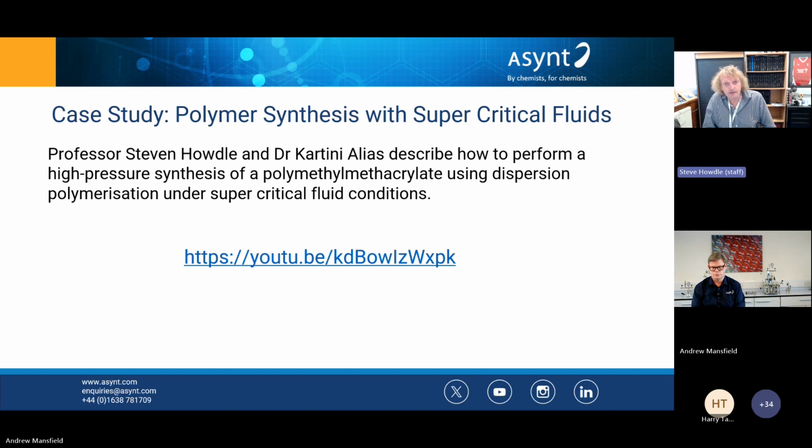So we've since moved on to a direct magnetically coupled stirrer that has quite a lot of torque associated with it. And I think Andrew will mention that when we come to thinking about the pressure synthesis vessel and how that's evolved as well.